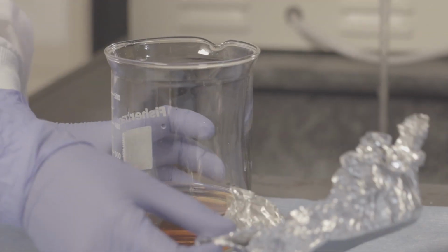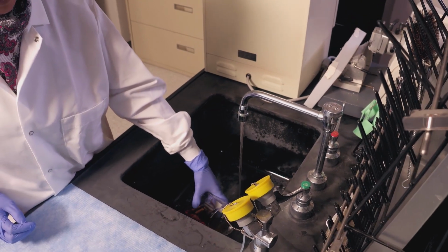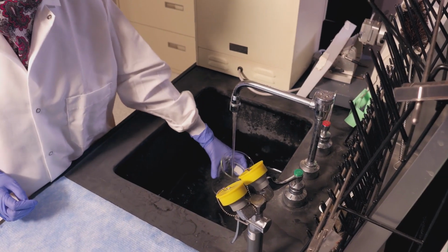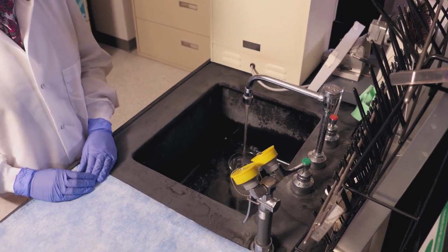Discard the leftover medium that now has a brown color into the drain. The leftover sodium ascorbate can also be discarded into the drain. Beakers are washed with deionized water, and work surfaces are wiped with 10% bleach solution after the daily work is completed.